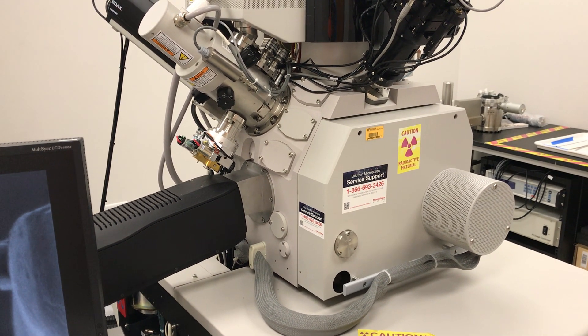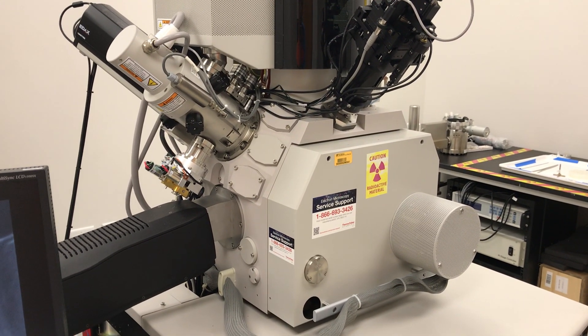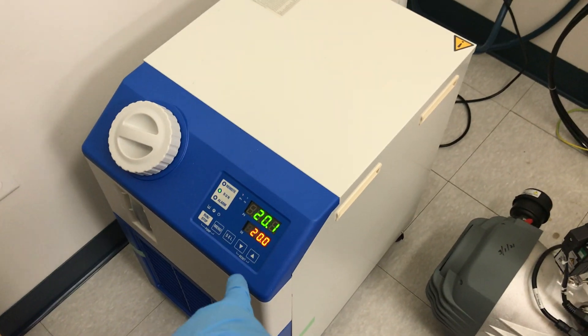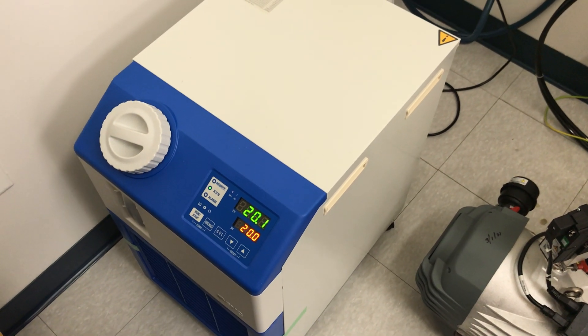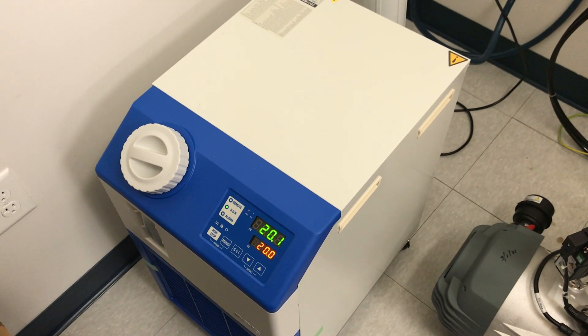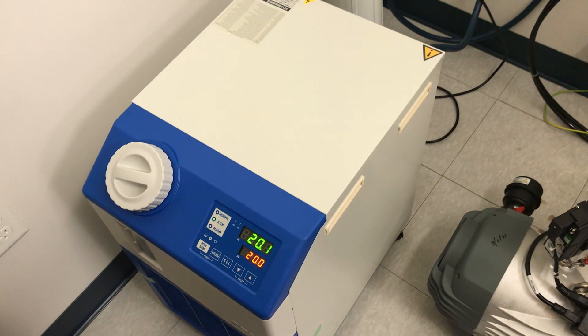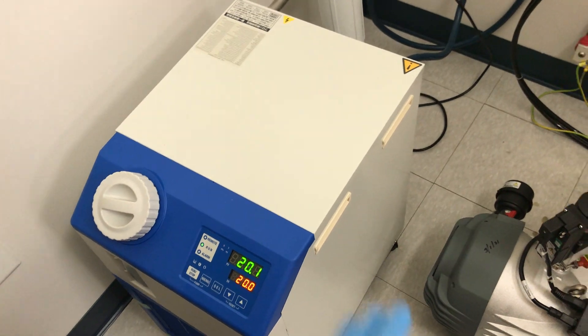This was an issue I ran into for a while on this specific microscope — this is a dual beam FIB, a Helios Nanolab. With this chiller, I wasn't able to get it down to 20 degrees. It was up around almost 30, which is really high and obviously not good for the microscope. The reason that was happening was I wasn't getting enough water flow through the microscope itself. And that's not an issue with the chiller — that's actually an issue at the microscope end.